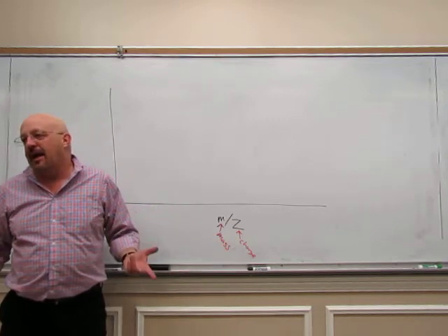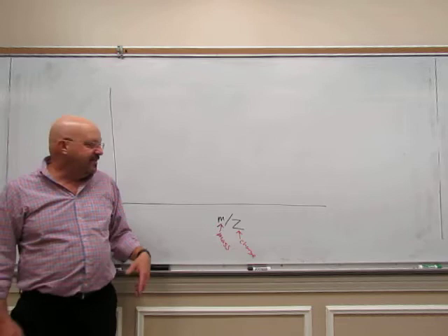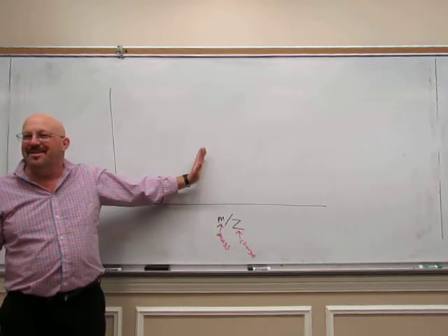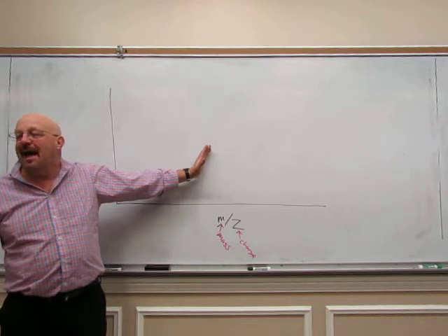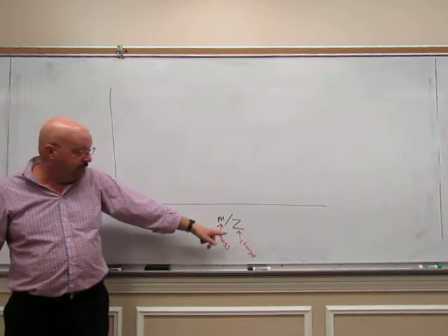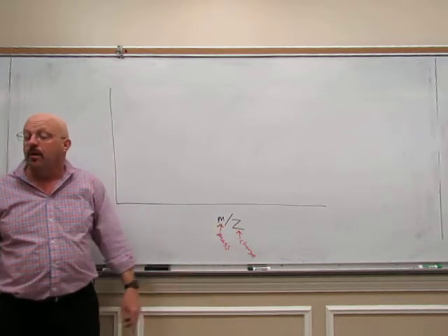Occasionally you'll make a dication or a trication. If it's a dication, it would be dividing by 2. So the mass you would see in the spectrum would actually be half of what it really is. It may show up at 50, but really it weighs 100 because it's being divided by the charge.